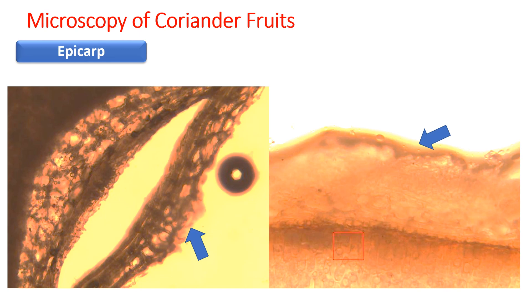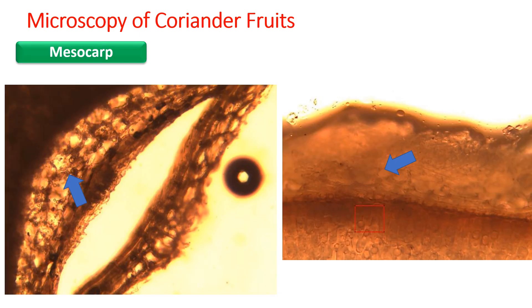This section has been stained with Sudan Red 3. As you can see in both images, the epicarp is getting a slight red color tint because the cuticle is oily in nature and absorbs the Sudan Red 3 dye, so you can see the red color appearing towards the periphery.